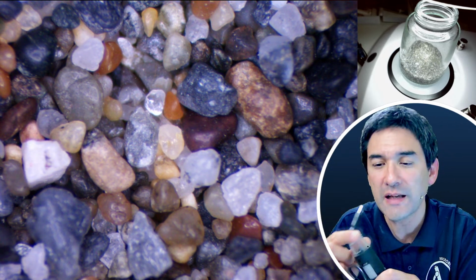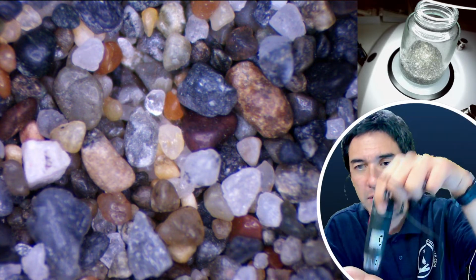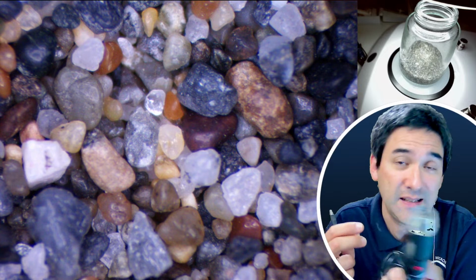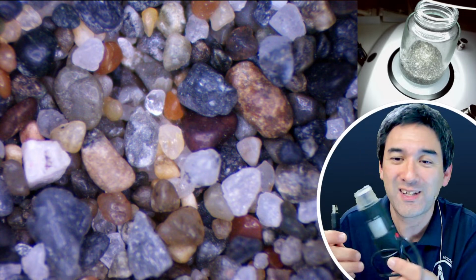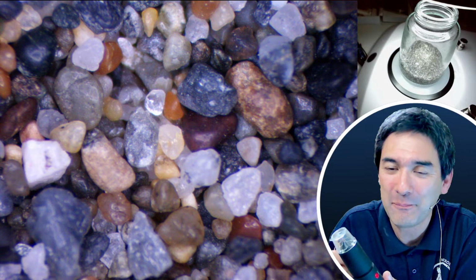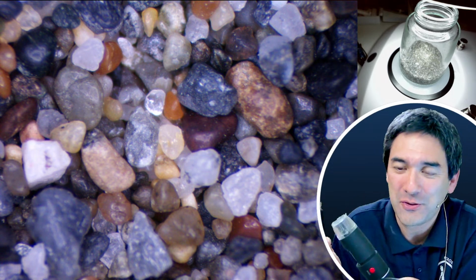But essentially, there's a camera in front, and there's even an LED. And then you take the thing off and point it at whatever you want, and you can actually get an image that looks exactly like the one that you have here, right? So this is a poor person's stereo microscope. Of course, it does not give you the stereoscopic effect, okay? I think they're really fun to use.